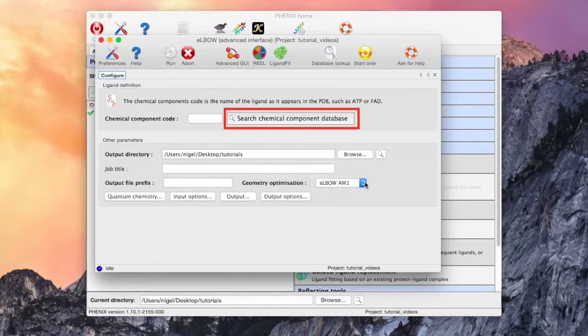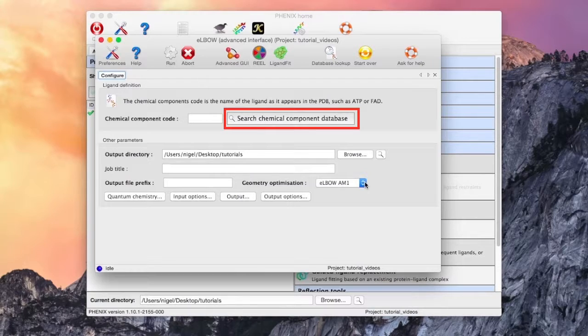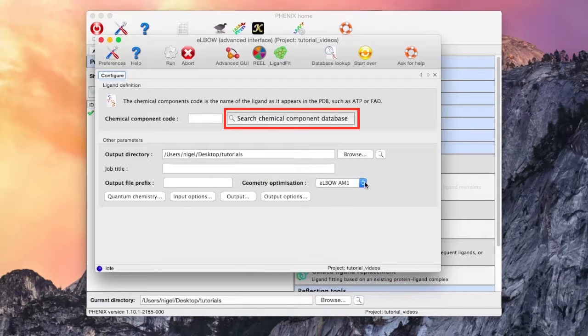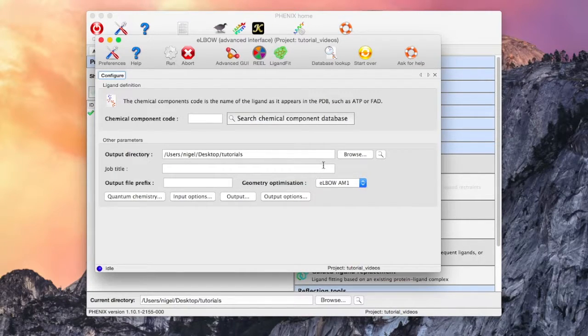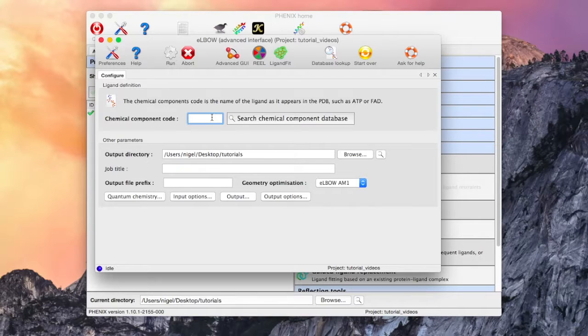This button allows for searching of the chemical components library. Searching for water shows the water molecule as well as other water-containing entities. We only need to enter a residue code to generate restraints.